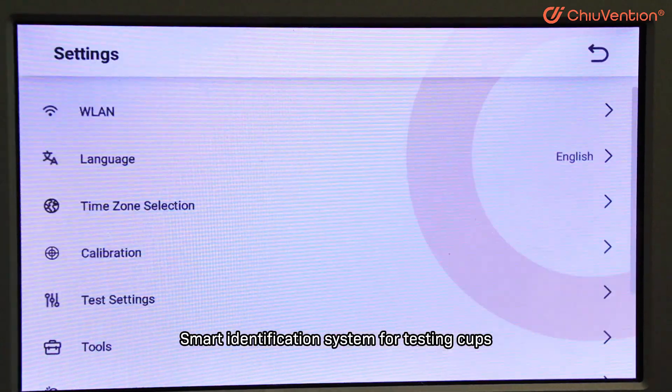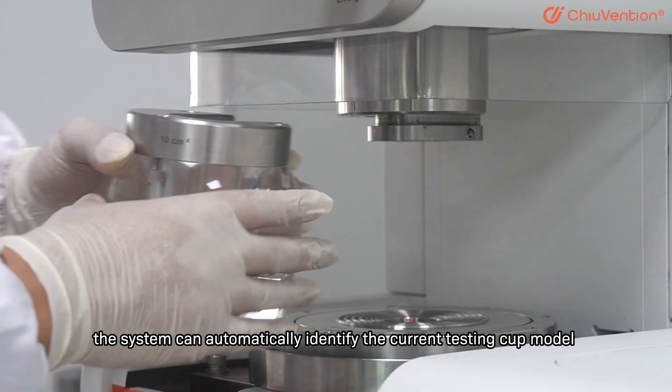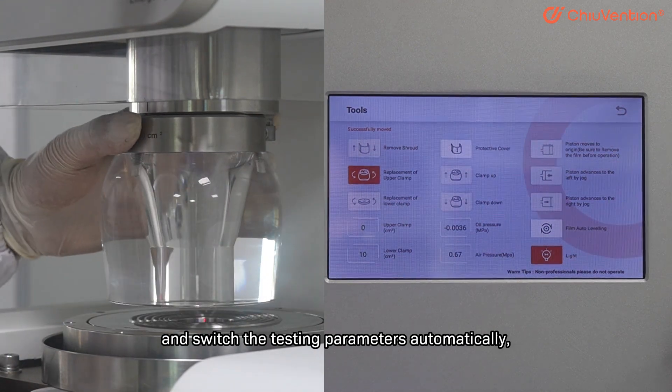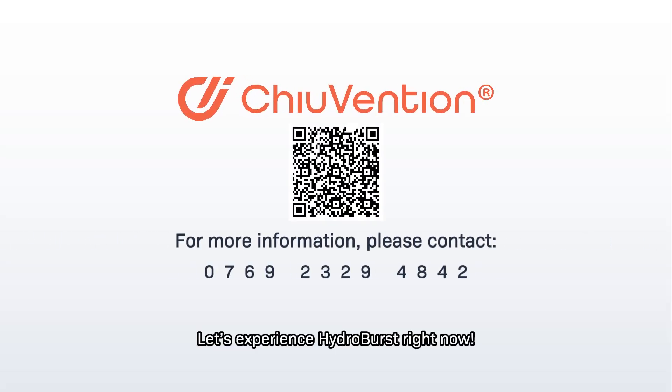Smart Identification System for Testing Cups: When changing the testing cup, the system can automatically identify the current testing cup model and switches the testing parameters automatically, which greatly improves work efficiency. Let us experience Hydro Burst right now.